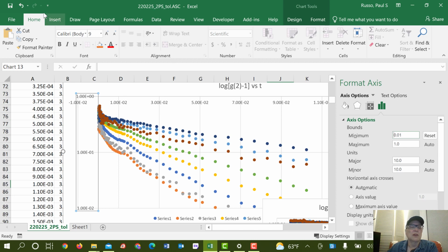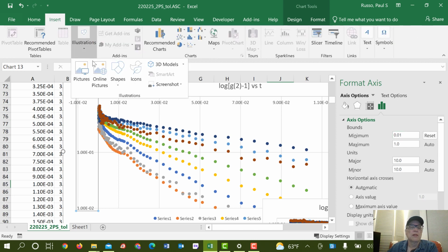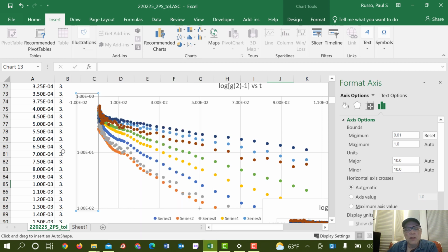Some of these angles show a problem, like this one has a little lumpy thing there. That's a problem. That's actually due to some sort of ringing effect there in the system, maybe a vibration, maybe electrical oscillation at some pretty high frequency. But there's no way to draw a straight line.